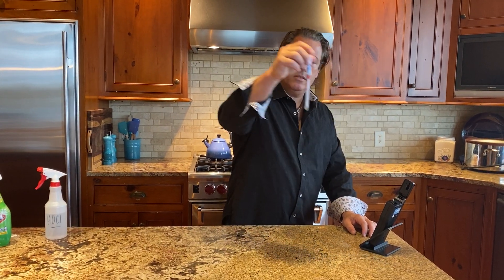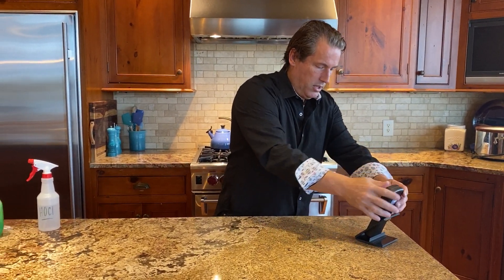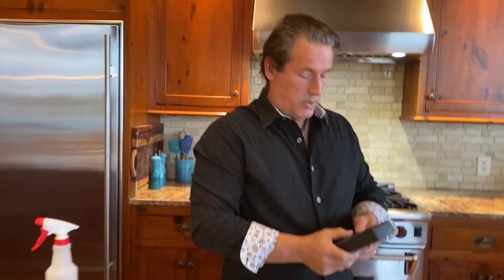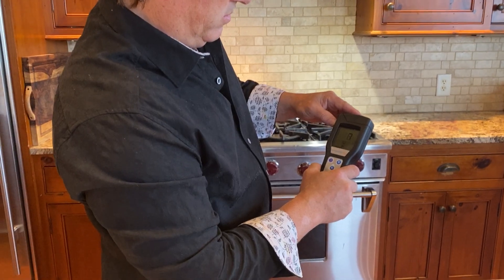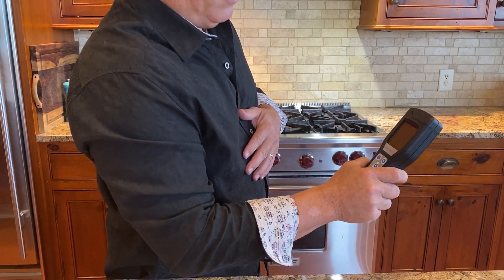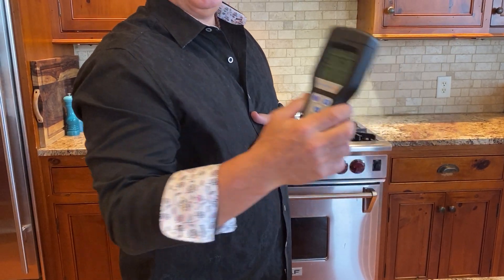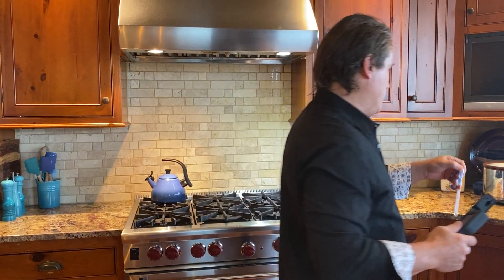You shake up the solution to activate it, put it in here, close the lid, hit okay. In 15 seconds we'll see what we got. Oof — 2800. There's some gunk on there, lots of bacterial activity. We didn't eat there last night — we ate out. That's two days.